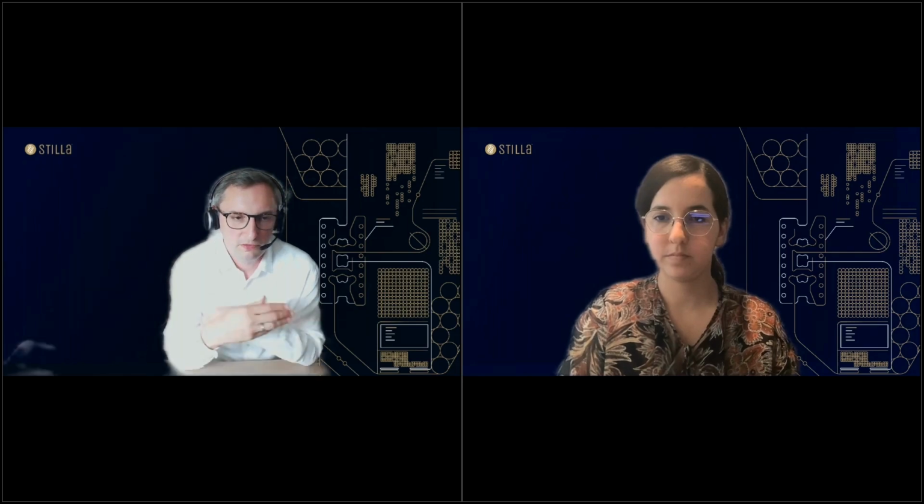But in the digital PCR, at least you have the possibility to pool all of them together, and then you know you have 60,000 partitions, and out of 60,000 partitions, you have 3 positive droplets. This is more powerful compared to what you can do with the qPCR from my perspective, because you get a very clear signal and you directly know this is positive, it works.